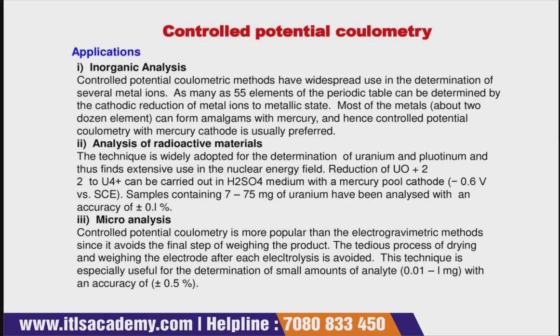Whether it's inorganic analysis, or whenever you want to analyze any radioactive material, for example uranium or plutonium, this method can be used.